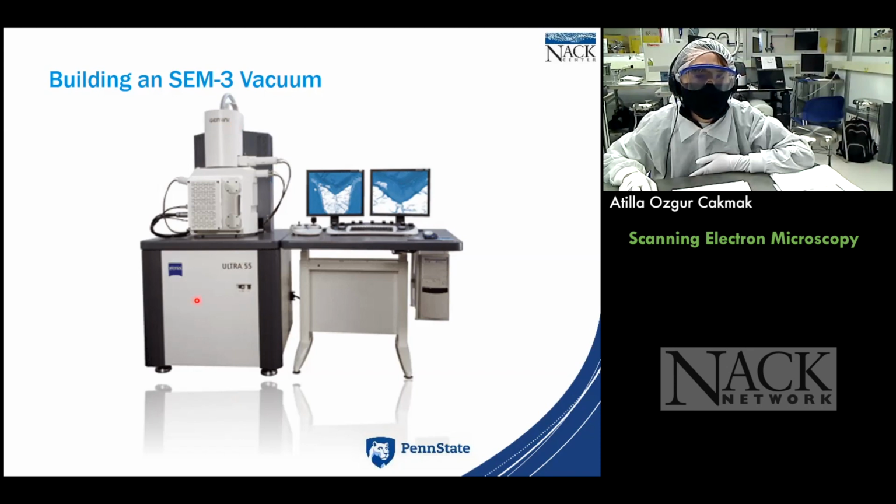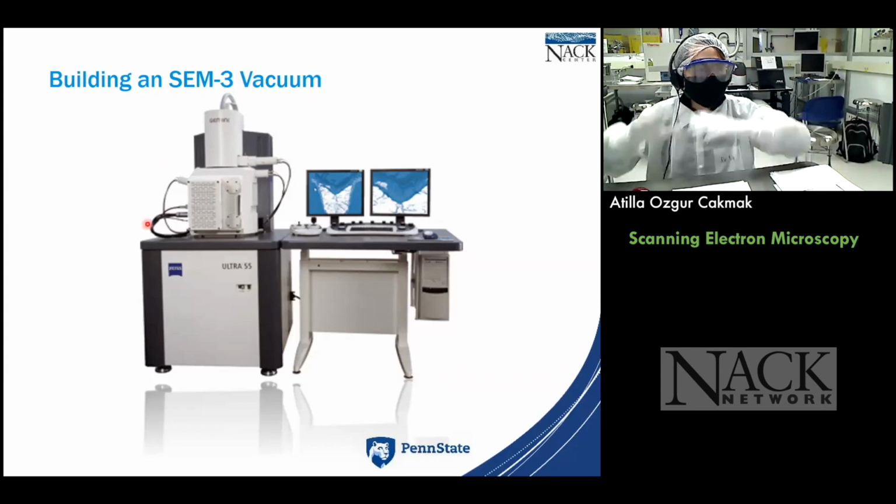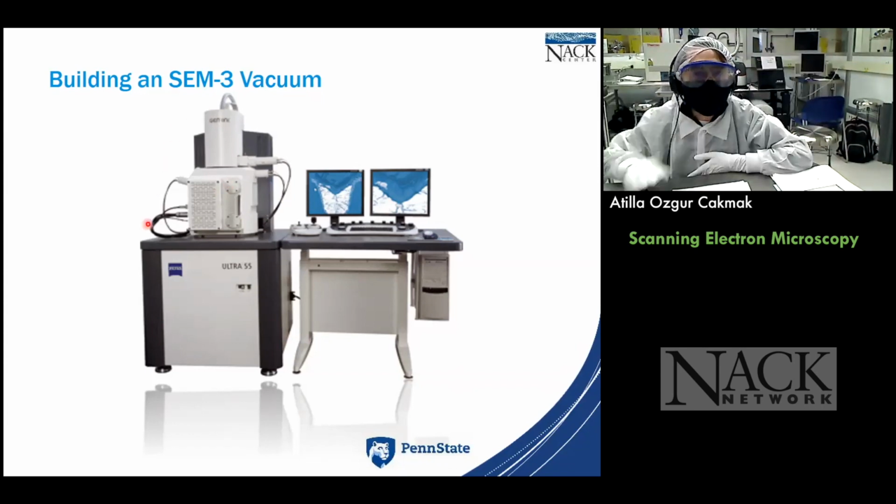So this is our electron microscope. I'm sitting in front of these two monitors, and this is my keyboard here. Everything is nicely concealed, confined into these chambers. This top part is what we call the gun column. This is where the electron beam, the gun, is.